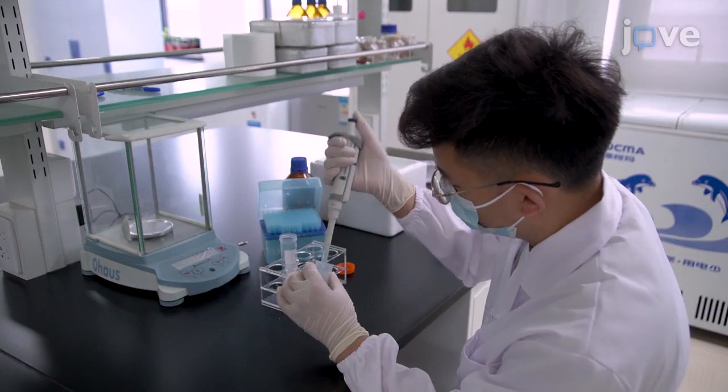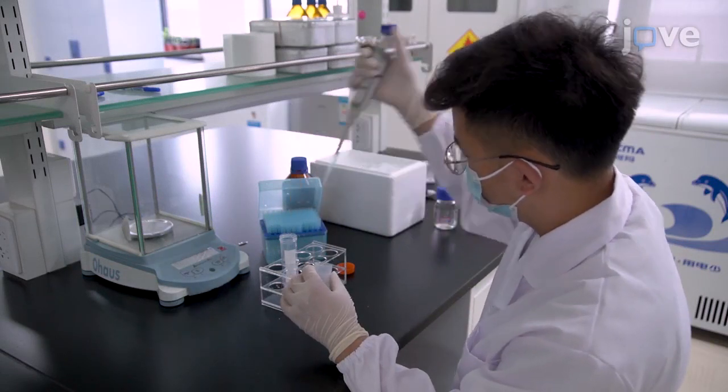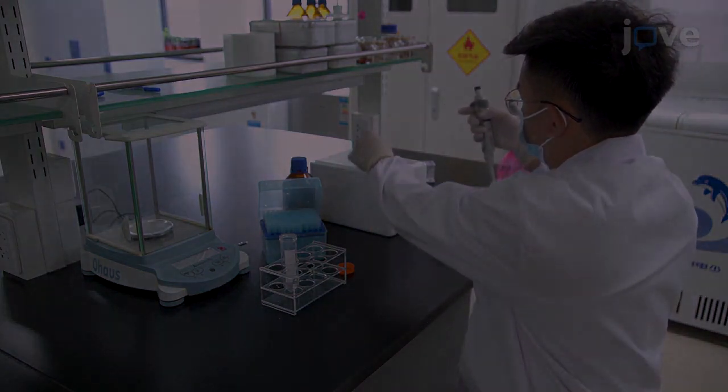Add 55 microliters of 37% formaldehyde drop by drop to 2 milliliters of sodium chloride buffer.